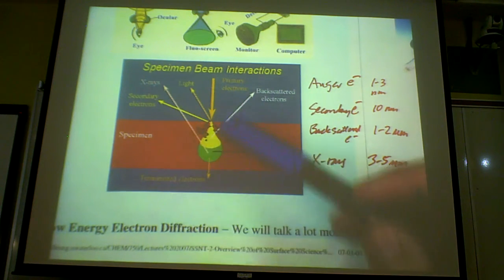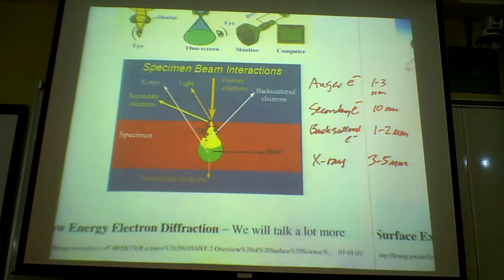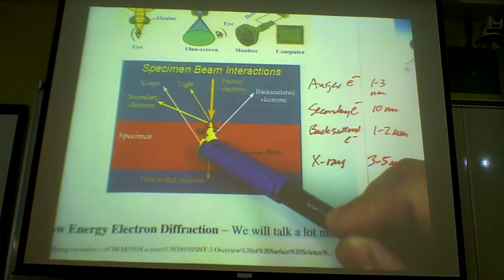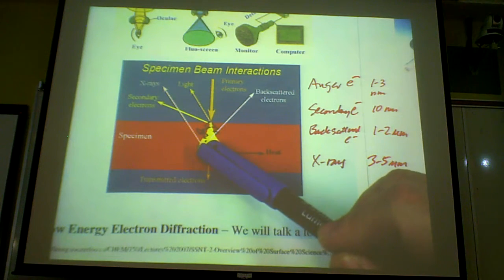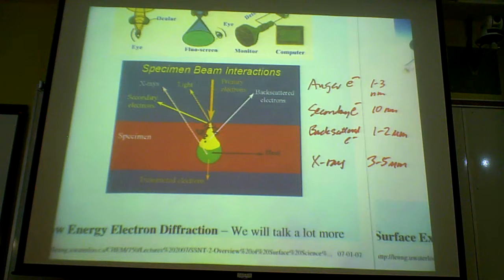The reason is that the electron is bounced around, and as it bounces around, backscattering occurs all the time. So some of them will come out, some will continue on, continue playing around in your lattice. Your backscatter electron typically probes 1 to 2 microns, so it's quite deep. It's not as surface sensitive as the secondary electron, but you can get a sense of what the element is.